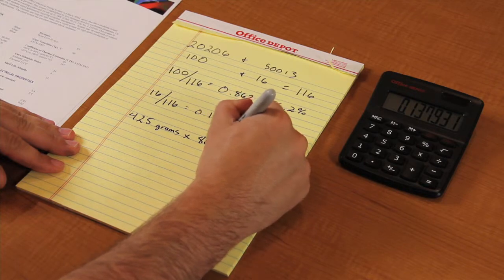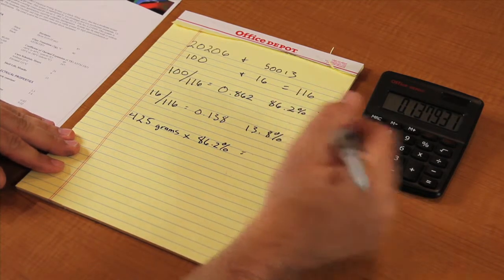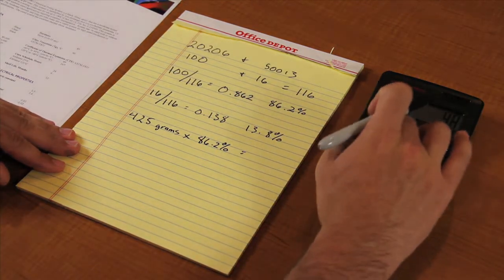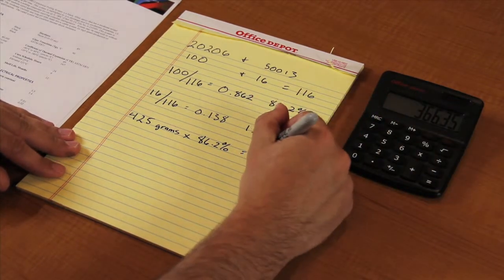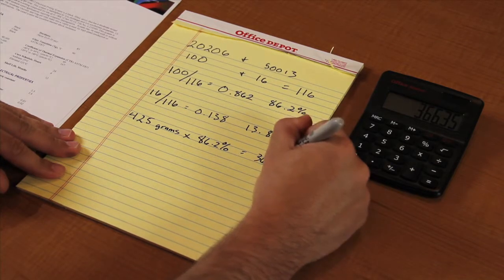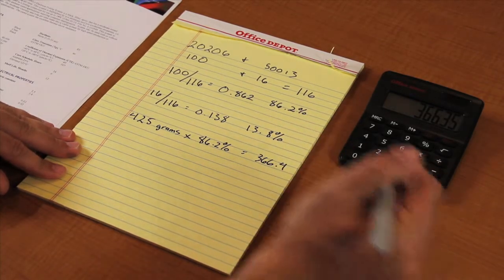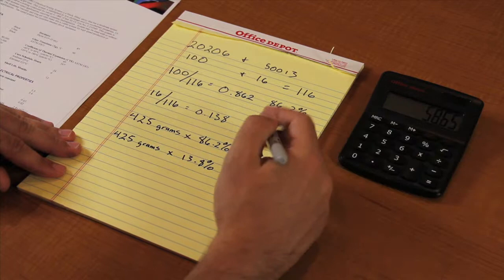For the purpose of this video, we will be using the amount 425 grams. 86.2% of 425 grams gives us 366.4 grams of 20206. 13.8% of 425 grams gives us 58.6 grams of 50013.